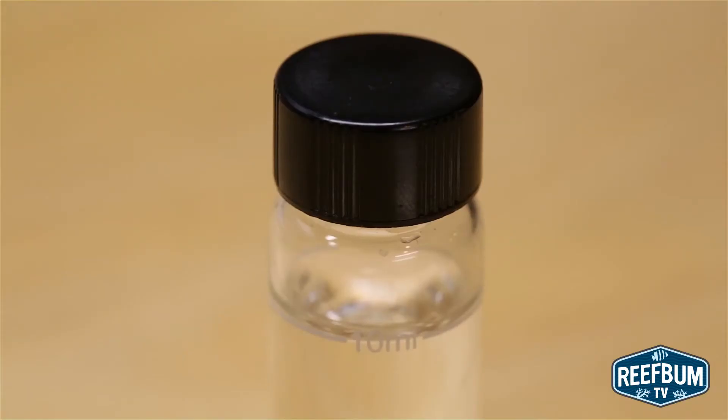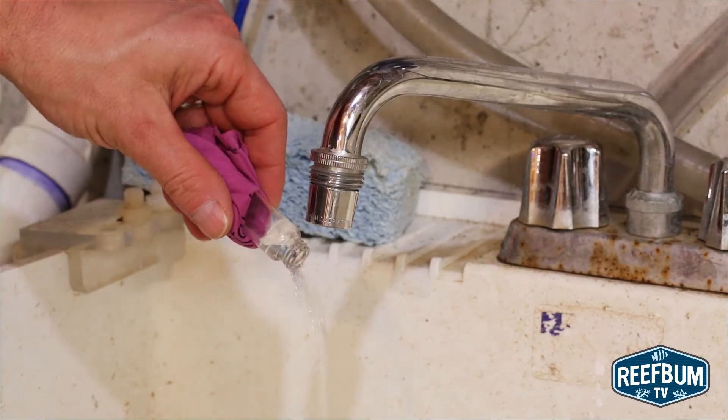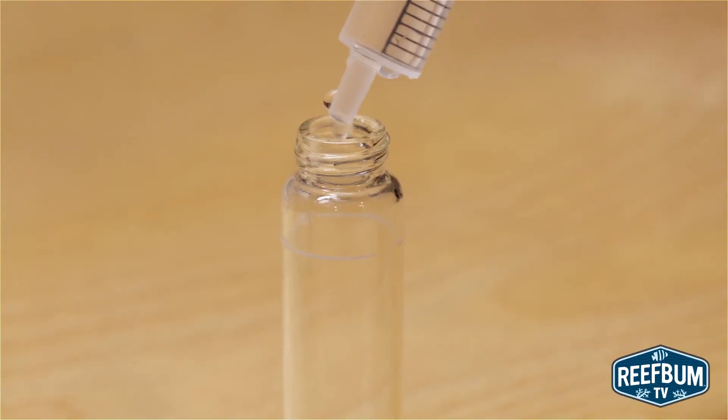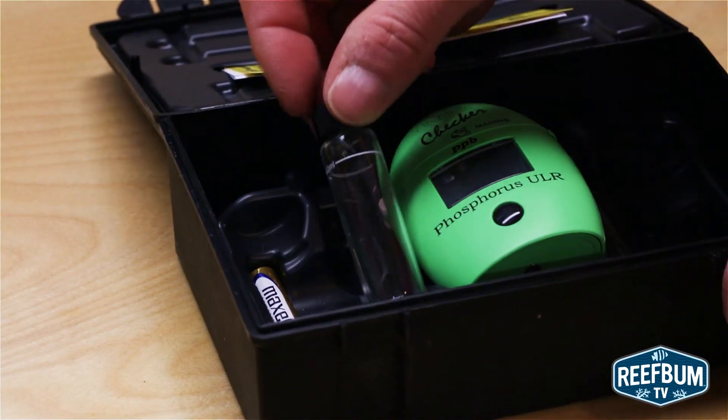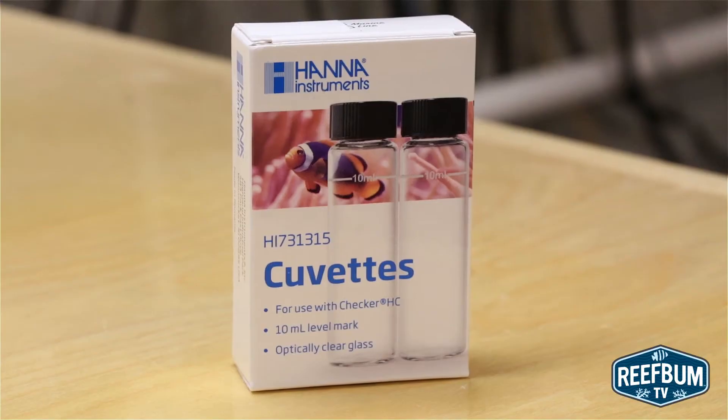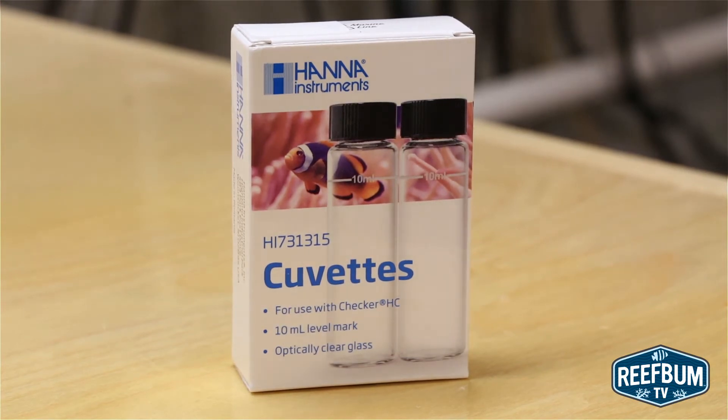Don't let the sample sit in the vial after the test is done. Discard it immediately as the vial might get stained and impact future tests. When done with the test, rinse the vials with RODI water, not tap water, and then tank water and put the vials back in the test kit. After using the vials for a year, replace them since they may get dirty or stained after a lot of use.